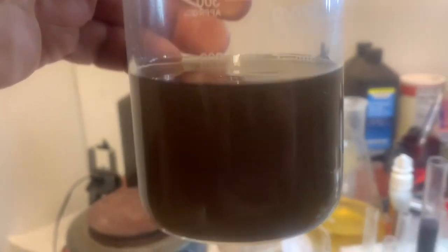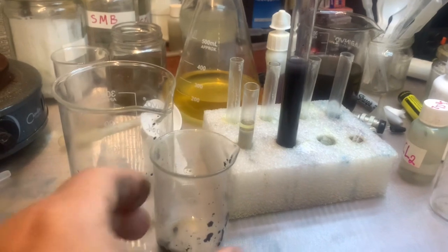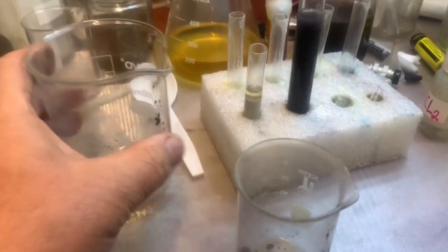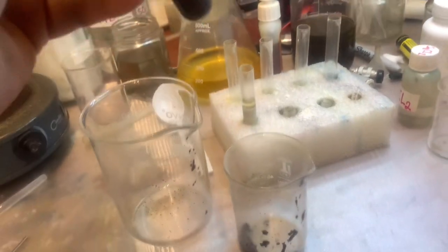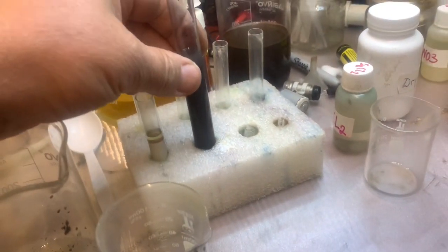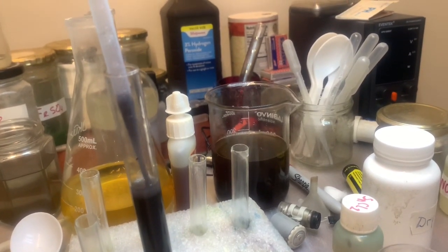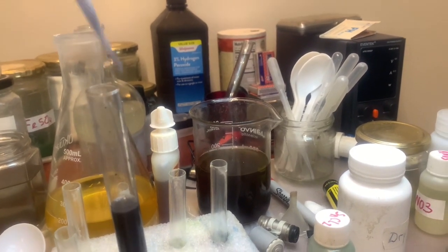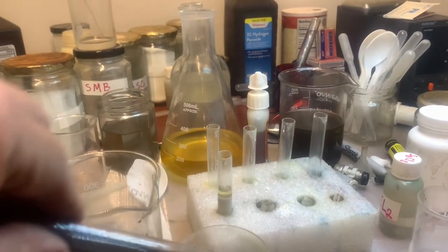Okay, so right now we have still dark solution something here. Keep it away. Let him stay for a few hours. Here we have colloidal gold, and here we have some debris, and here we're settling down all this stuff. So we can even take that little amount of water from surface and transfer everything to one beaker, and we start dissolving that gold.